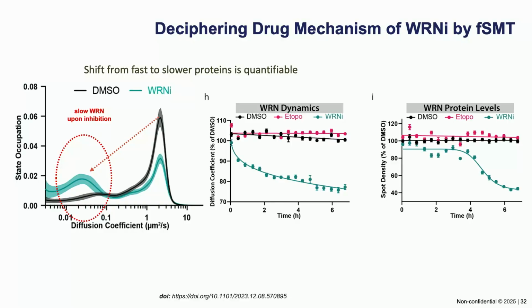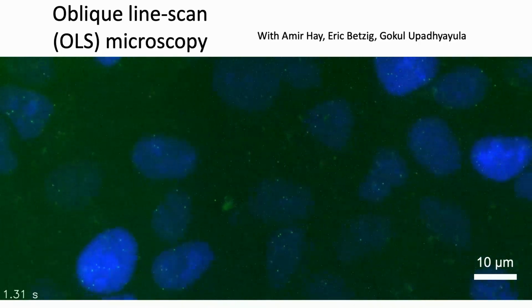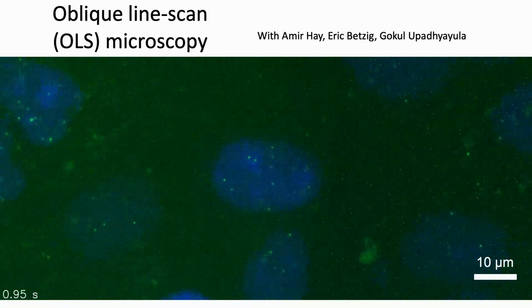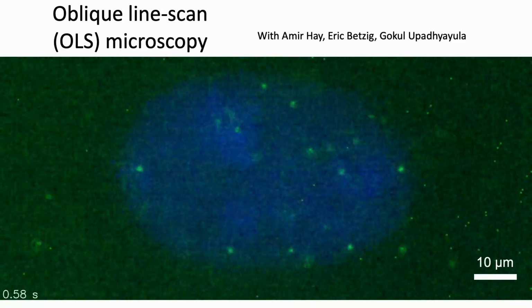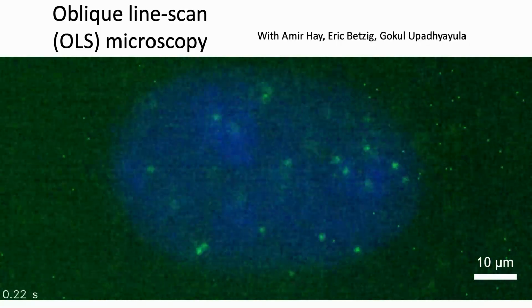And it's really an amazing tool to discover new biology, to characterize small molecules, and hopefully to discover new drugs. Only the future will tell us if we get these drugs approved. These have extremely high potential to treat different cancers. So we got very excited by this result, and we brought these microscopes back to the lab and started building our own OLSs in the lab to gain the same larger fields of view and measure more data. And so these are now experiments that are done again in the lab.